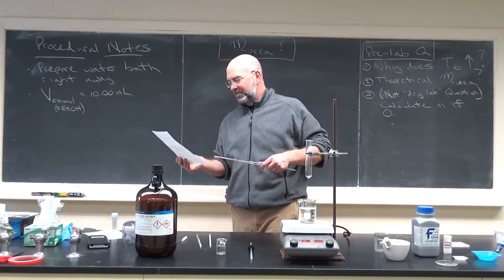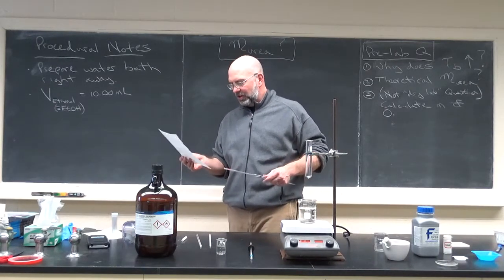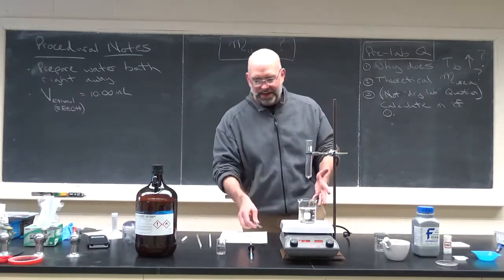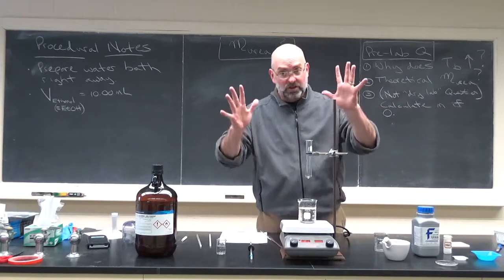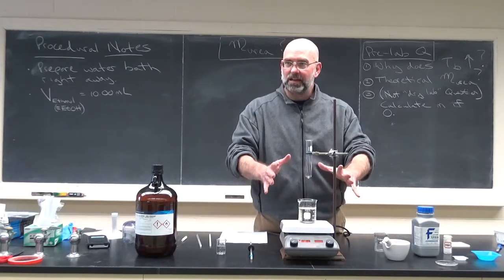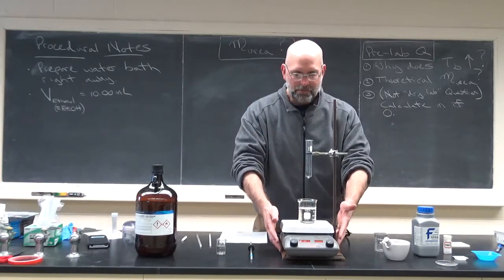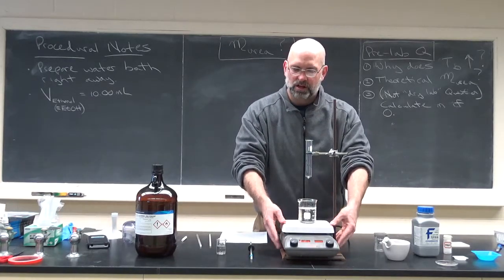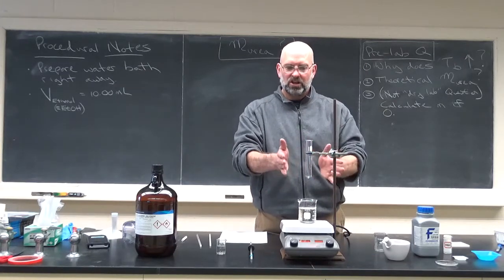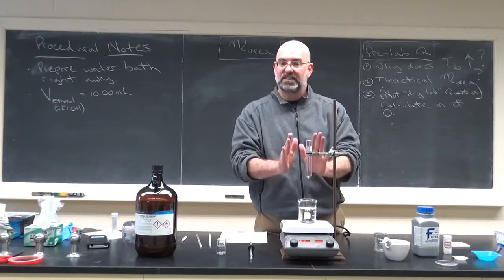I'm not going to read that whole thing to you, because what I have here is already set up. So what you want to do right when you come in the lab is get out a ring stand and a hot plate, and the hot plate you choose may not sit all that securely on the ring stand, so you might not do exactly this setup. You may have the hot plate sitting off to the side.